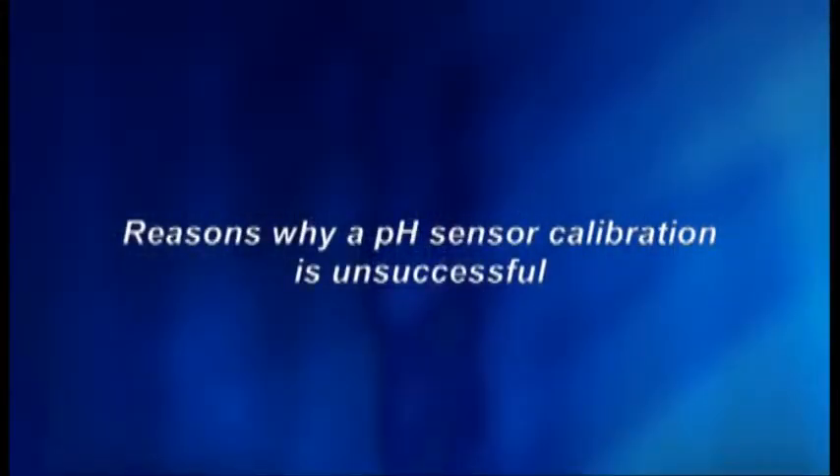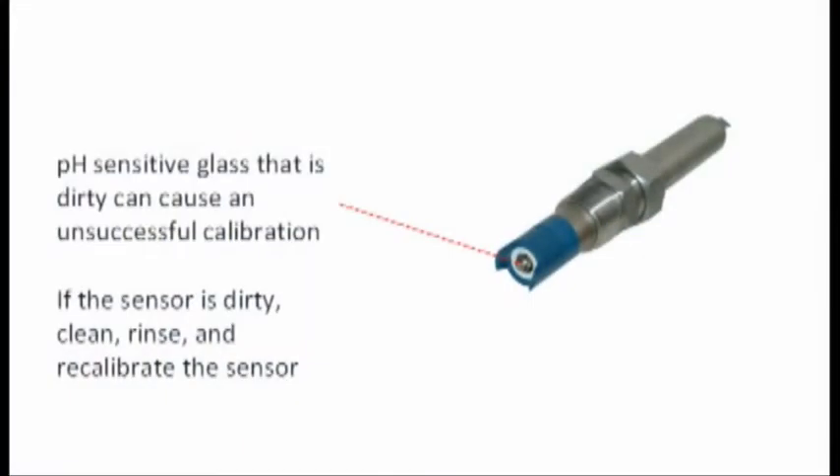If the calibration was unsuccessful, the sensor may need to be recalibrated or replaced. There are a few reasons why a pH sensor will not calibrate, causing the instrument to show an error message. Reason 1: the pH-sensitive glass is dirty. Cleaning the pH sensor may resolve the problem. In this case, clean, rinse, and recalibrate the sensor.